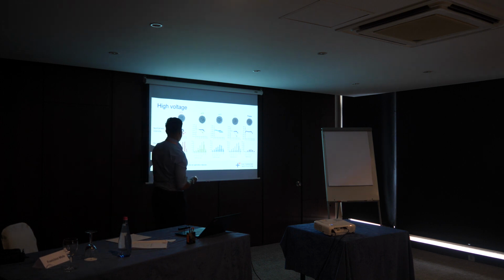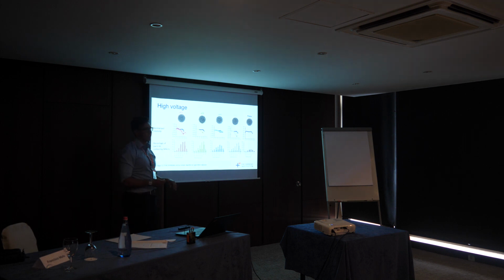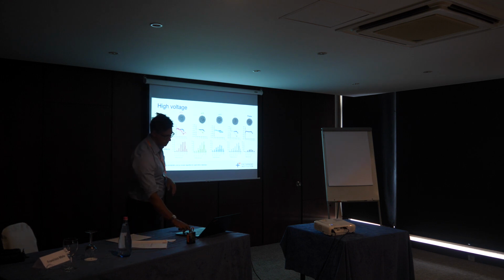So this is a percentage of particles that contain a defect. And we can see that as the particle size is bigger, more particles have a defect, and all of them have more particle defects than the pristine. So this is a nice way to compare, if you have something that you've never used, if you cycle it a little bit, how does its damage change over time? And then if you try and undo that damage, how far can you go?